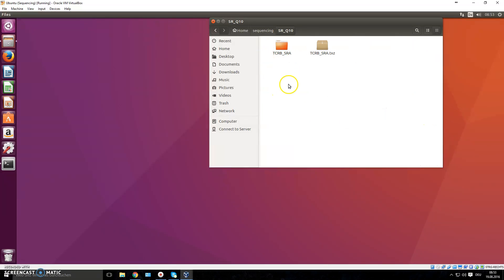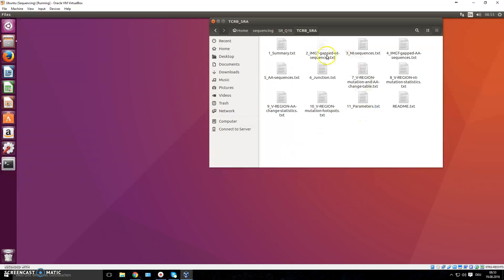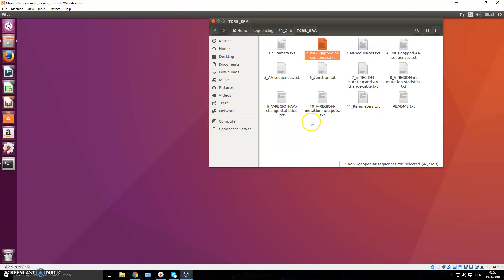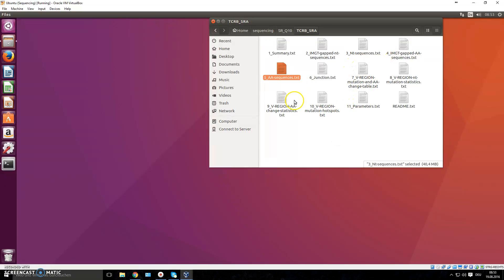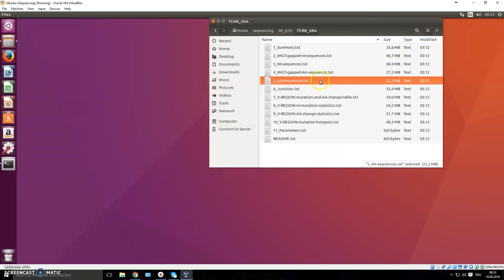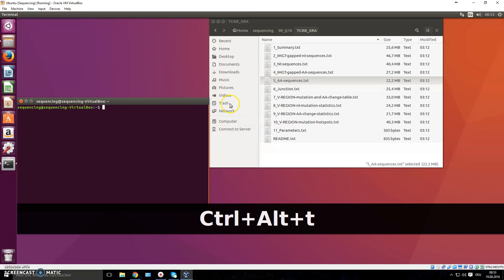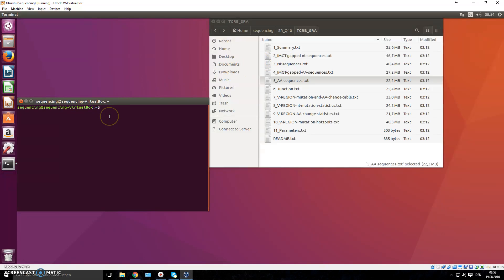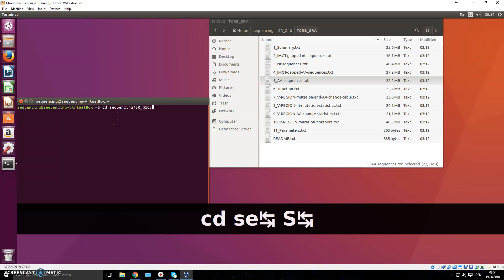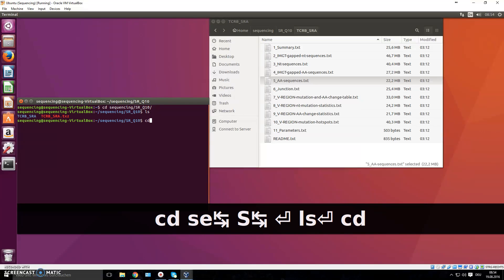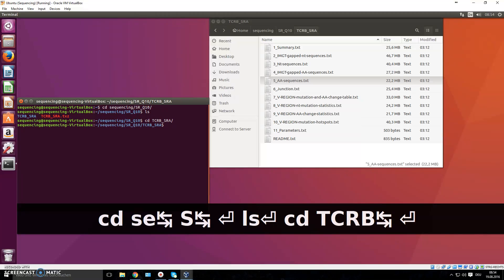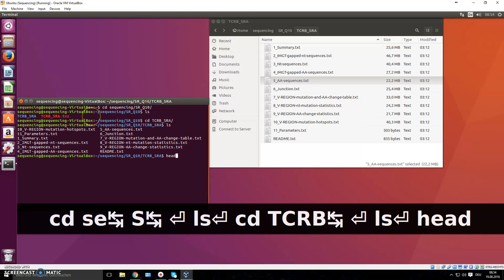Now this is the information you're interested in. You have a summary file and different annotated outputs, but for us the most interesting are number three — the nucleotide sequences — and number five — the amino acid sequences. I'll open up my terminal with Alt+Ctrl+T and move into that folder. This was the TCRB folder, and we can now have a look inside number three.